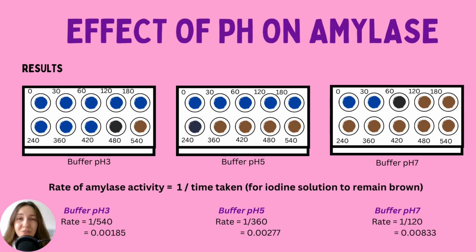Now, these results may not be accurate. I have just made these up for the sake of demonstration, so please don't take them as gospel. But I will say, one thing you could identify is the color changes are quite easy to see, and in this case, it's not always easy to see, which is why we have to do repeats. We obviously want to collaborate in our class and look at different results of other people.